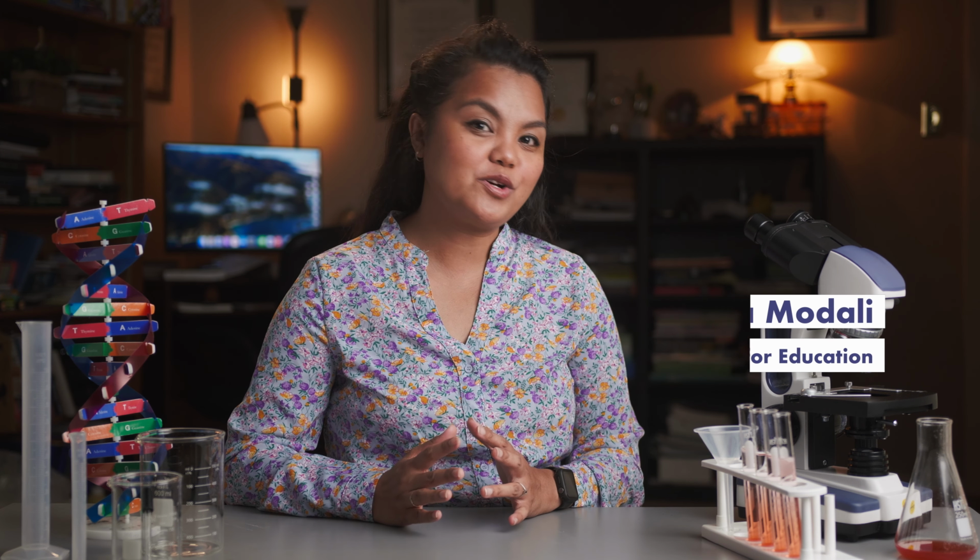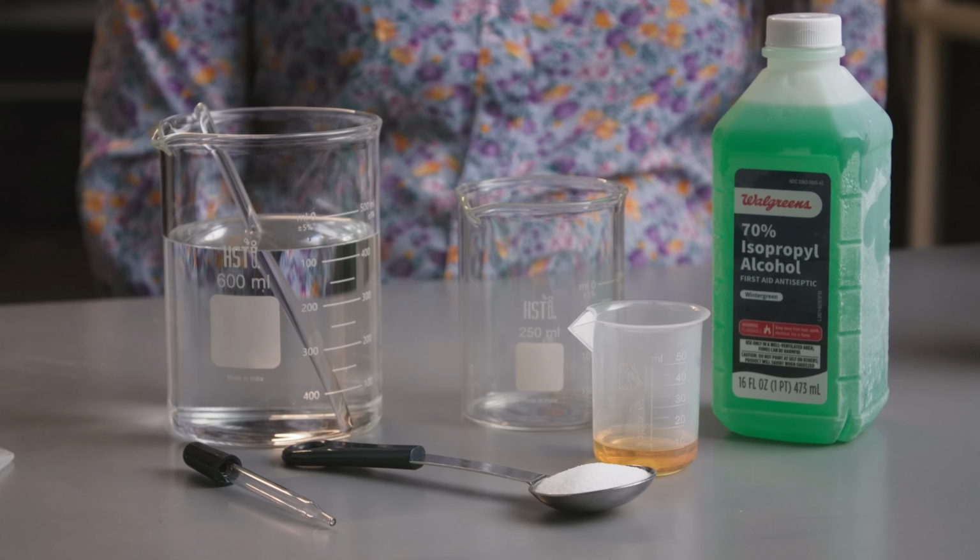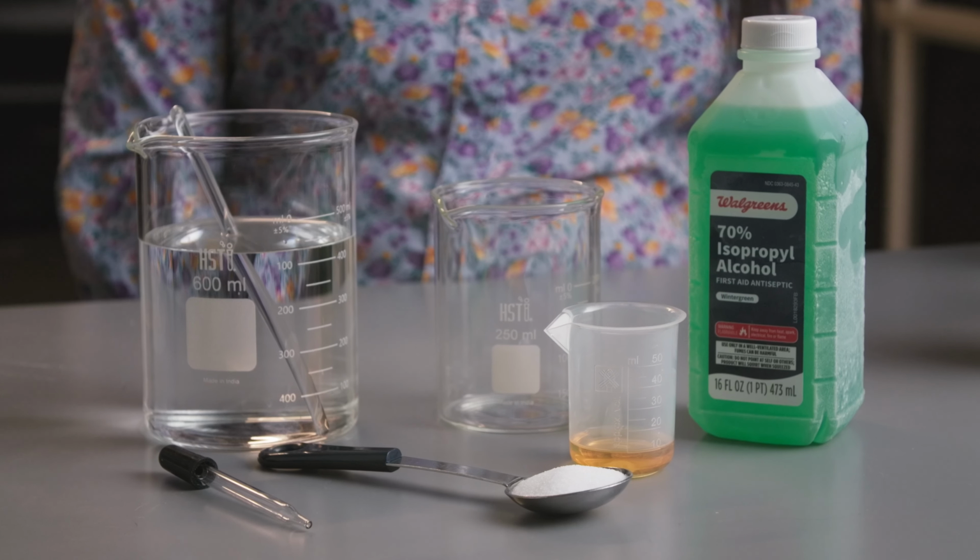In this episode, we are going to learn a little bit about DNA by doing an activity, human DNA extraction. Collecting human DNA can be done in different ways, from hair, saliva, urine, skin cells, blood, etc. But today, we're going to do it in a non-invasive way that you can do at home, which is collecting it from saliva.